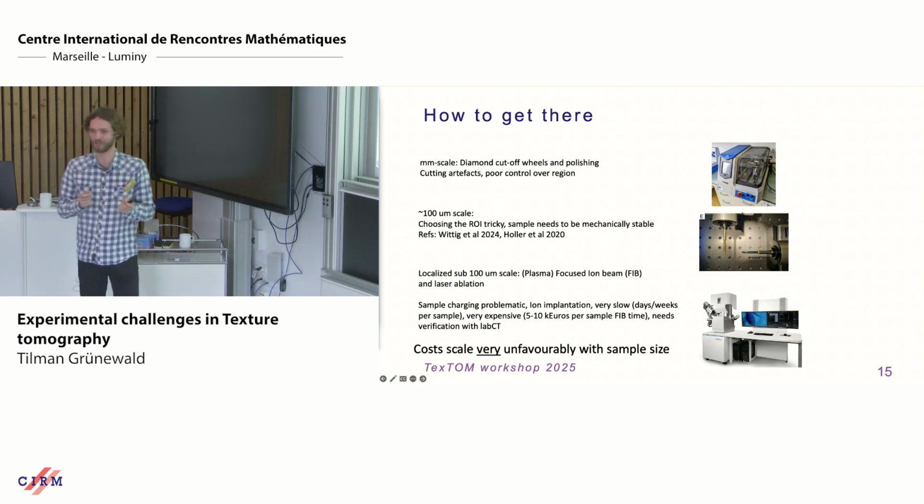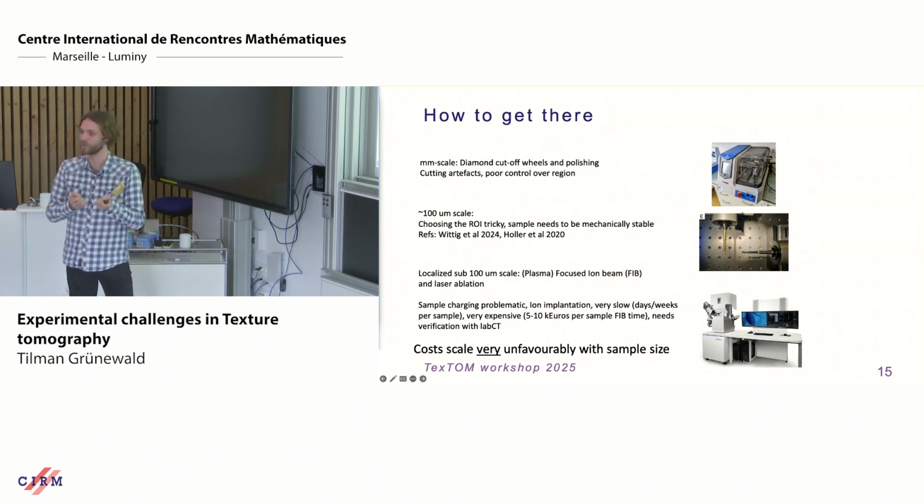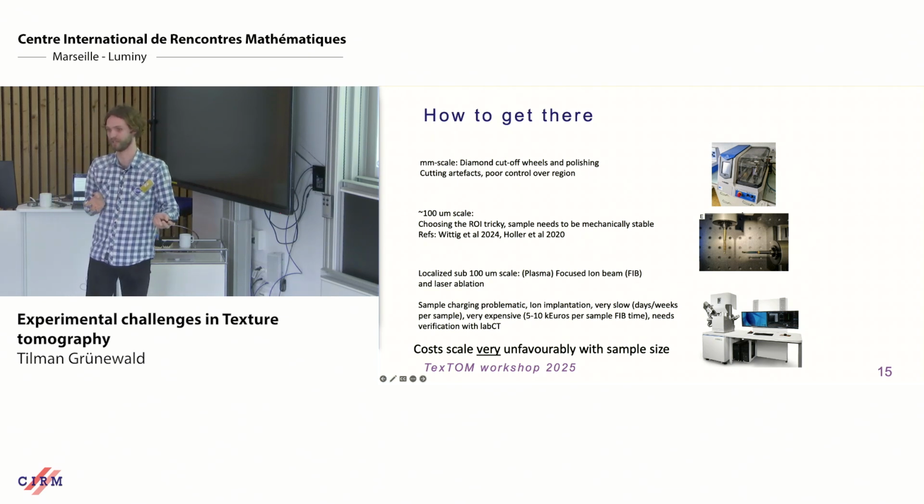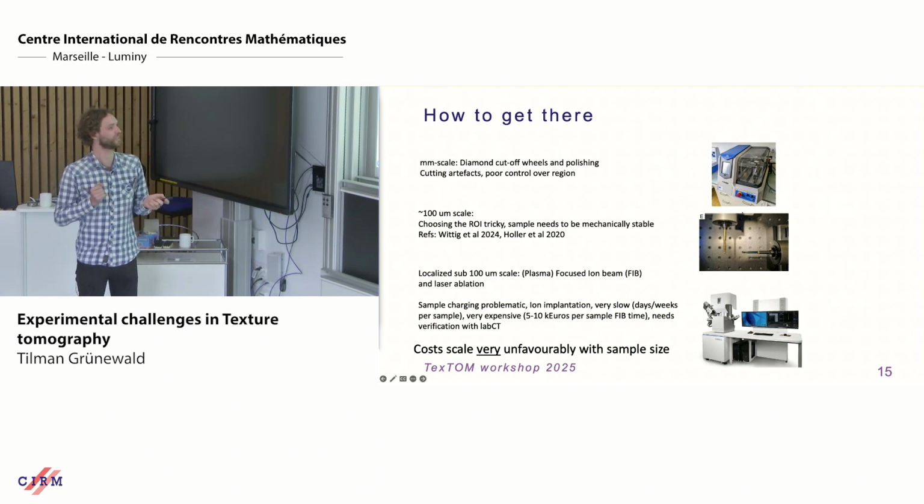So really think about your experiment before and how you want to prepare your samples, because the good news is once you're here, you've done 80% of your work, in my opinion. Getting the right samples is really most of the work, in my opinion, for these kind of techniques.